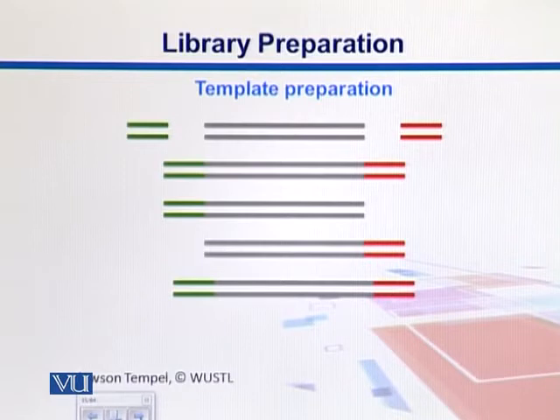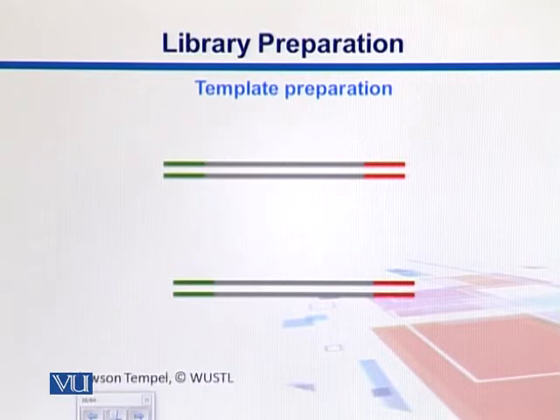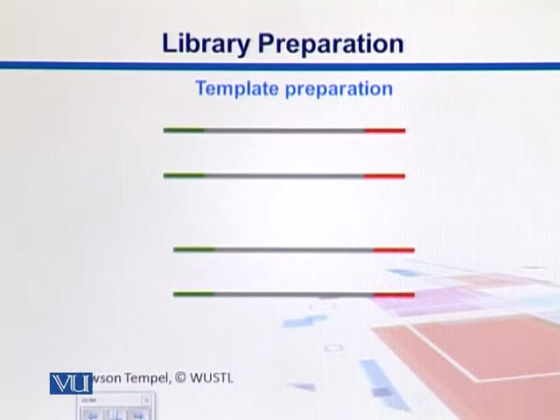Here in this small animation, we can see again the attachment of adapters, right? The adapters are attached to these two fragments. So they are selected, and the rest of them are discarded. Then we take these fragments and we make them single-stranded. Since we know that replication is a single-stranded process, the same is used in sequencing. So having single-stranded templates is an important requirement in sequencing.